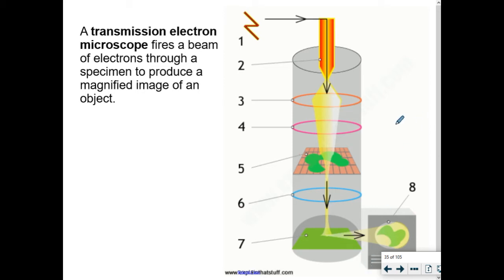Here's what you do. You take a focused beam of electrons and you fire electrons through a sample of stuff. Okay? Maybe the best example I would give you is it's kind of like a shadow. Imagine that I were standing against the wall right here and you were to shine a big light at me. If you were to look at the wall behind me, my shadow would make it so that there would be a dark section where light didn't get through.